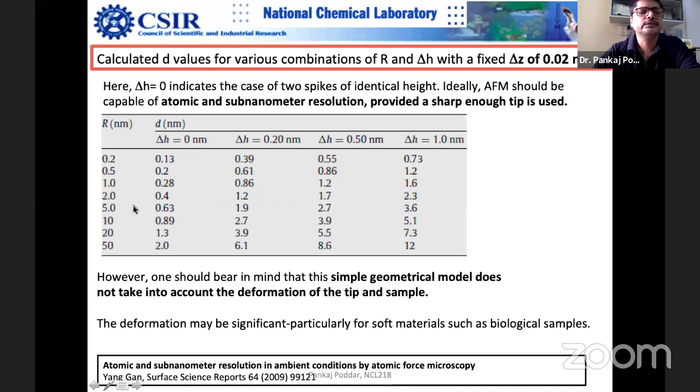So if you see that this value is a practical value. Actually, most of the AFM tips have a radius of curvature around 10 or less than 10. I mean, either you can select this or this. These are ultra sharp probes. Normally, these are expensive, and more than 10, nobody uses. Actually, these are worse quality tips.